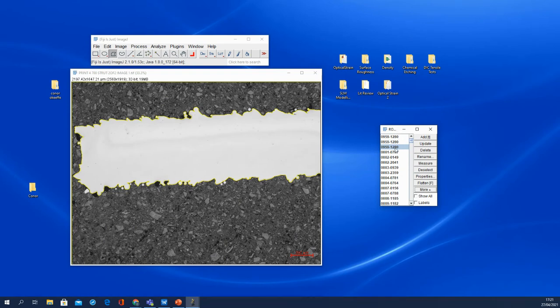There we go. Okay. You can see we've basically got an ROI now for all the small individual particles that we've created, but also for the single strut. Okay, so the single strut is the last ROI.